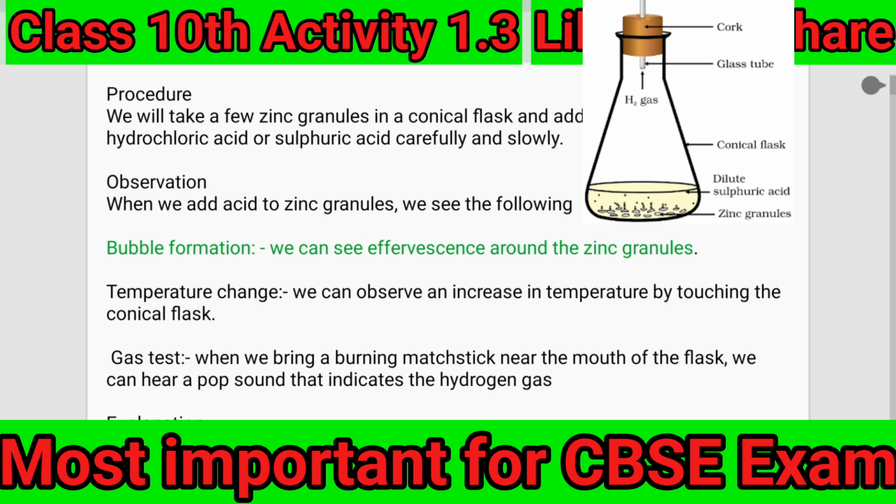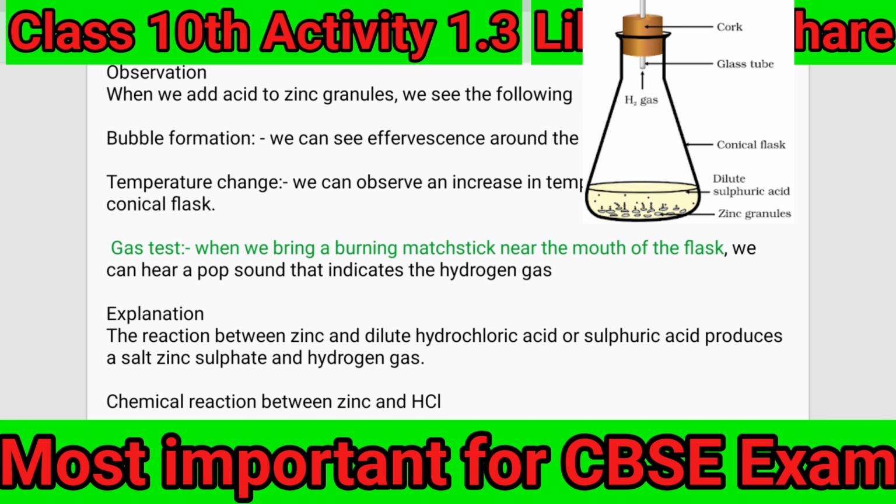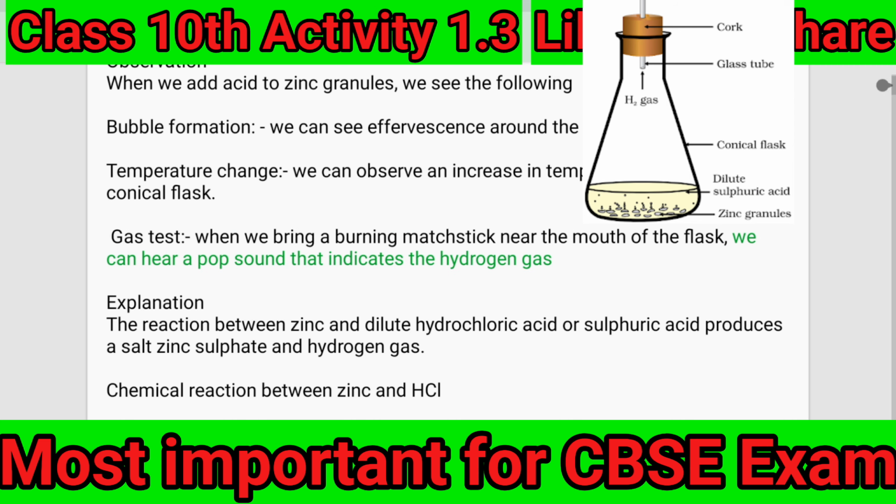Bubble formation: we can see effervescence around the zinc granules. Temperature change: we can observe an increase in temperature by touching the conical flask. Gas test: when we bring a burning matchstick near the mouth of the flask, we can hear a pop sound that indicates hydrogen gas.